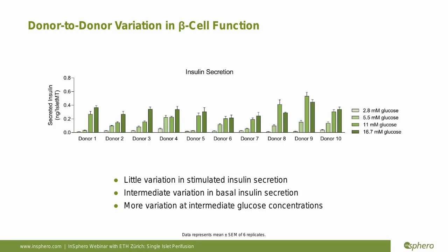surface of different donors, and a well-known personal variation. And of course, all the donors we have tested are healthy, or not diabetic. So if we were testing donors in insulin resistance or diabetic, we expect obviously more difference in these preparations.